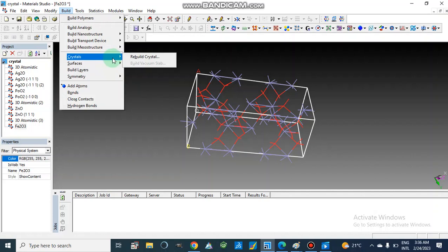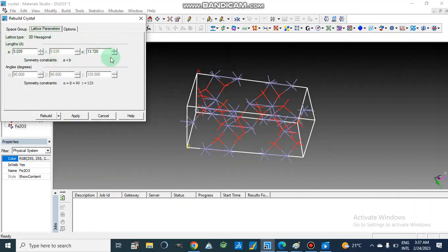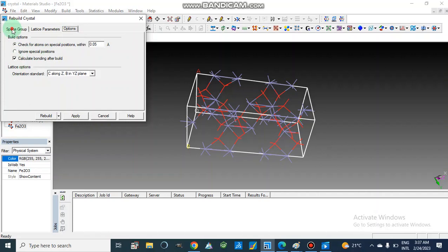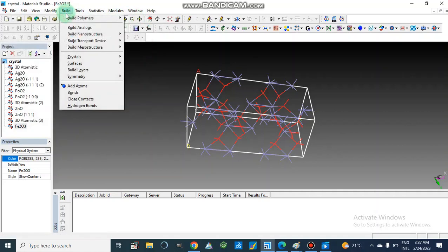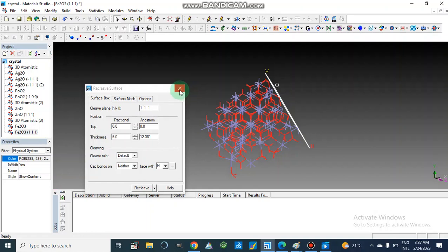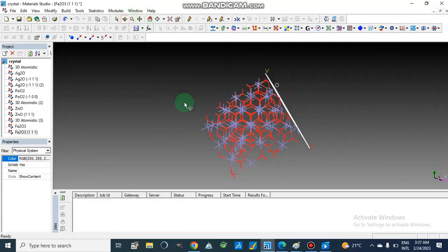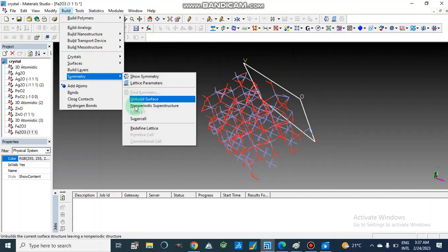We can rebuild the crystal — we have this option with the latest parameters for the iron oxide crystal. We can rebuild our crystal structure by entering different options. This is a hexagonal type and these are the parameters. Now I am going to Build Surface and Cleave Surface. We can change the cleavage plane — thickness is 5. Now this is our iron oxide crystal surface. Now go to Build, Symmetry, and Make Supercell.